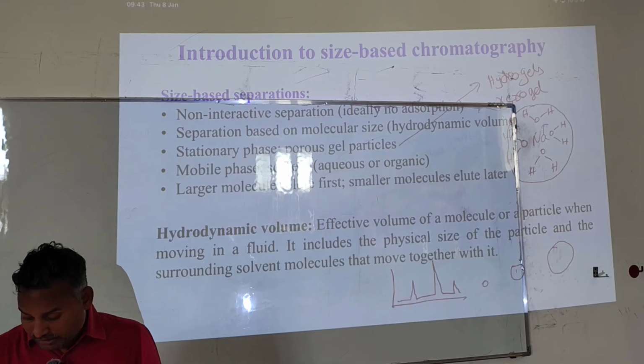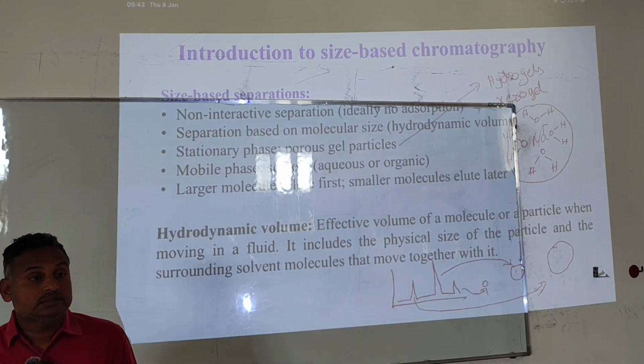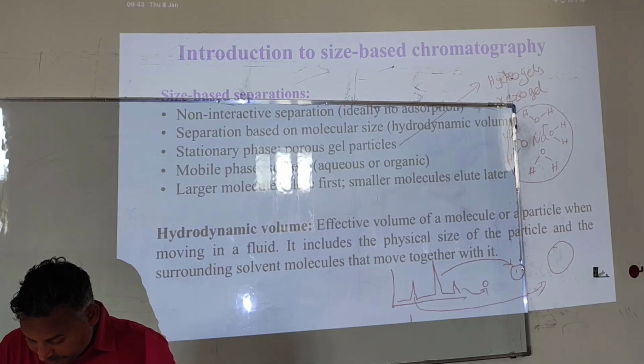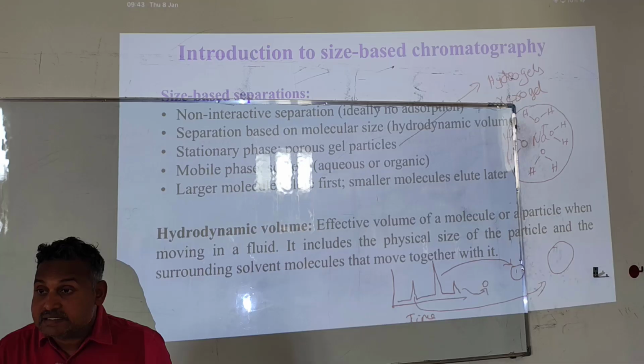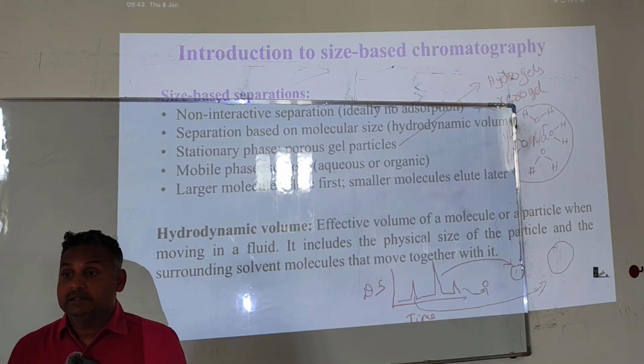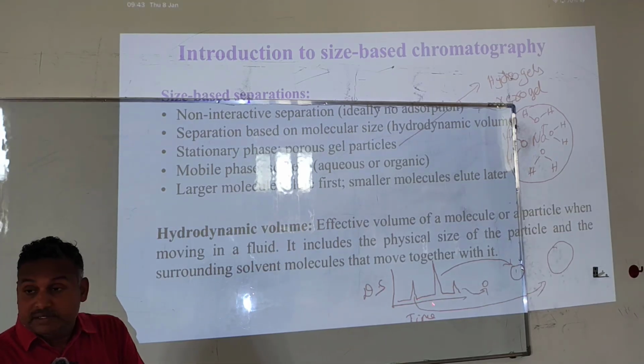This peak corresponds to this one. Because the x-axis is time and the y-axis is detector signal. Did you get the point?